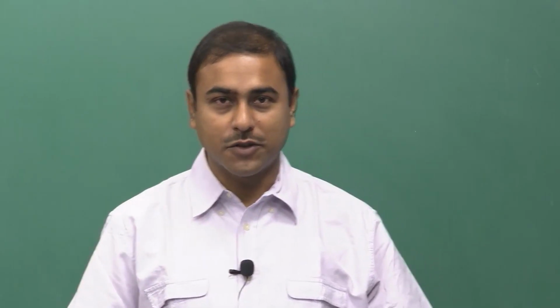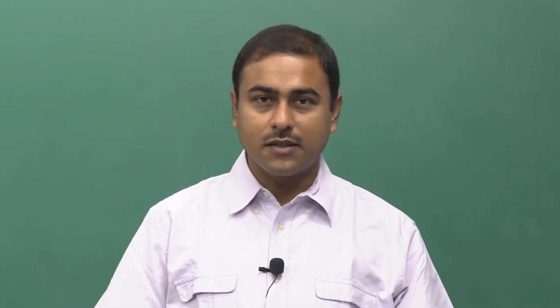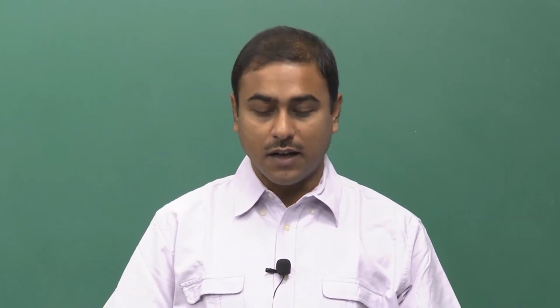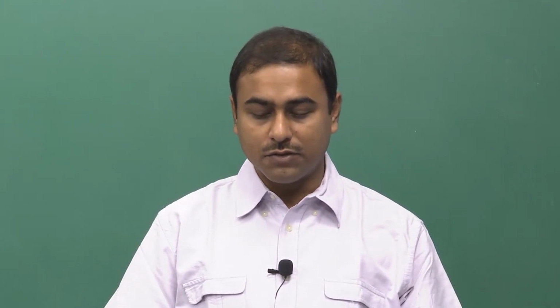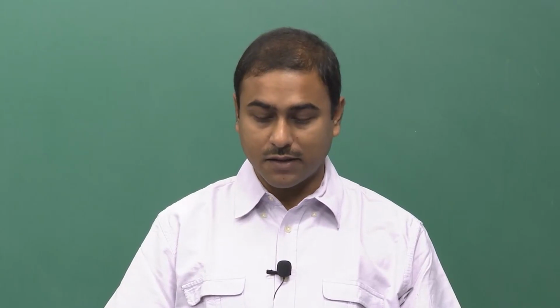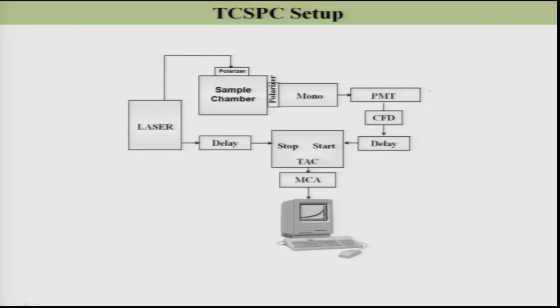Welcome back to lecture number 20. Till last class we were discussing the TC-SPC system, and I have already told you about several parts of this TC-SPC system. Let us have a quick go through all the different components of this TC-SPC setup.